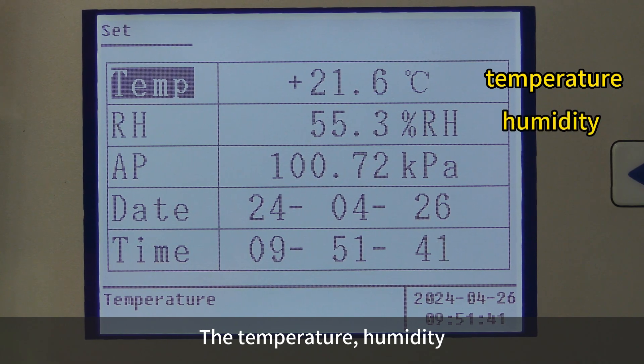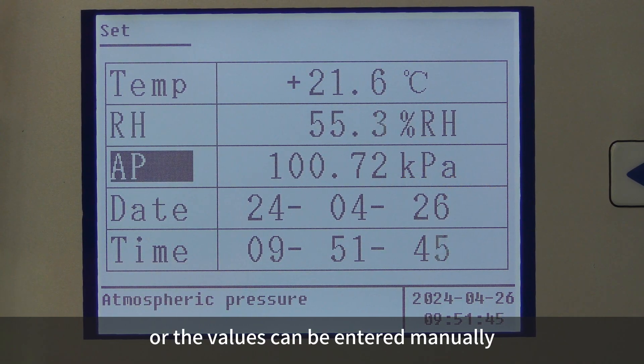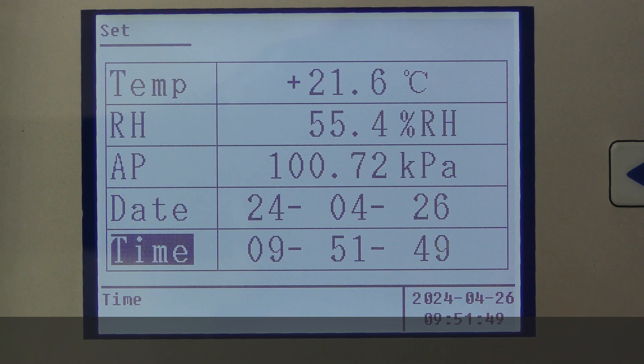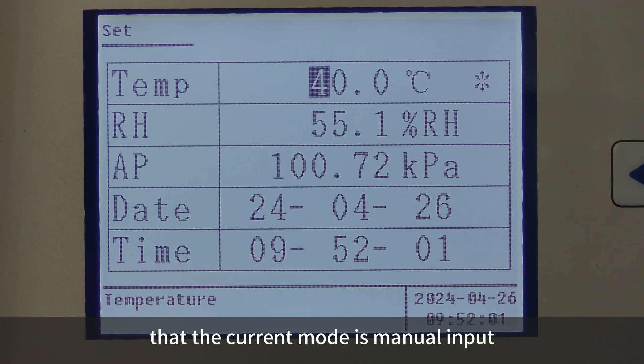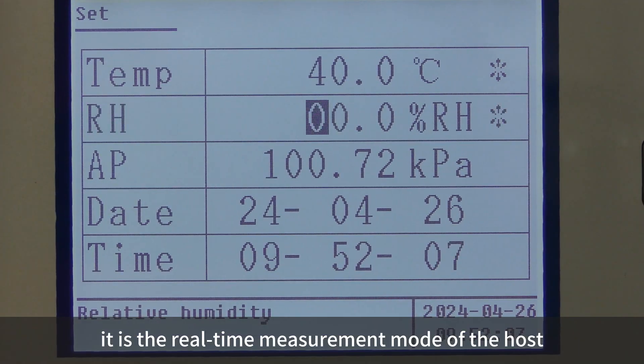The temperature, humidity, and atmospheric pressure of the sampler can be measured in real time, or the values can be entered manually. An asterisk after the value indicates that the current mode is manual input. Otherwise, it is the real-time measurement mode of the host.